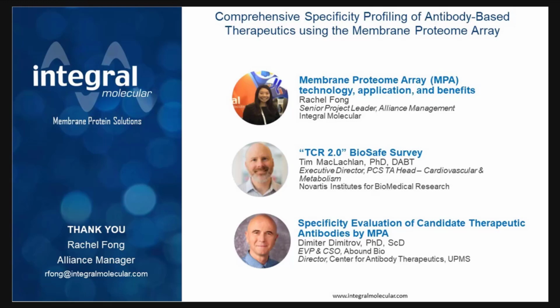It comes up a lot. It is tough with 6,000 different proteins that will all express a little bit differently, of course, but with the tag, it really gives us a good big picture.